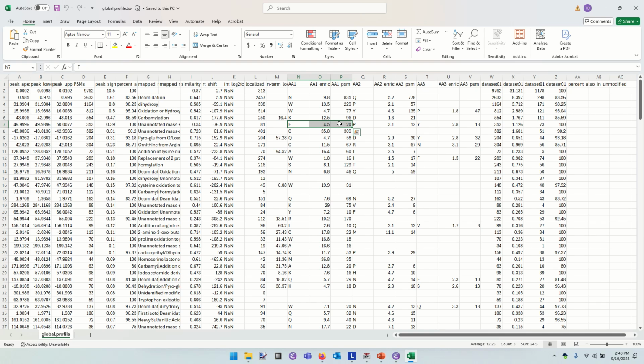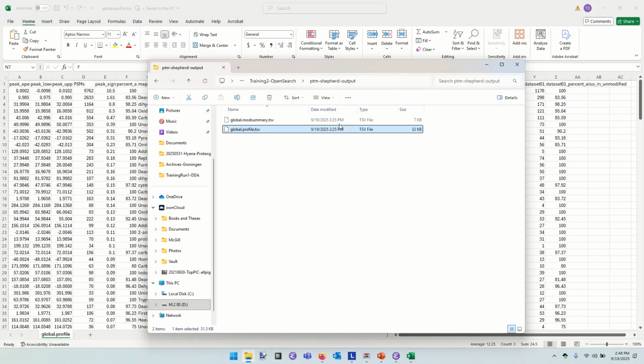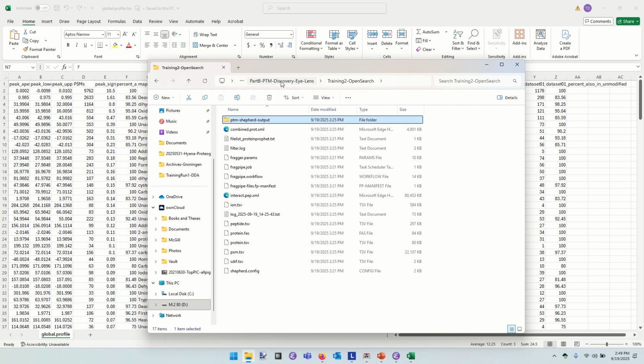Do we want to go digging into it? Well, one can. In this case, it's not so bad. The files in PTM Shepherd output are summaries at a high level. Like I said, that one was summarizing 20 tandem mass spectra for just that one amino acid. So we can go into the modification data and dig through this. Now, do I need to do this on the PSM or the peptide list? Let's see where we get with the peptide list for a start.